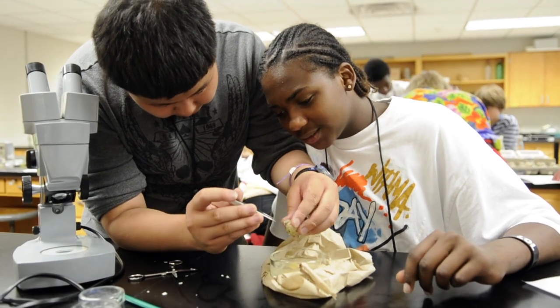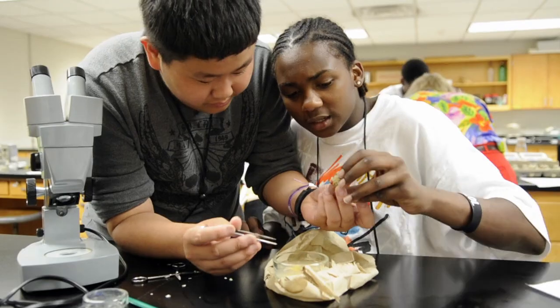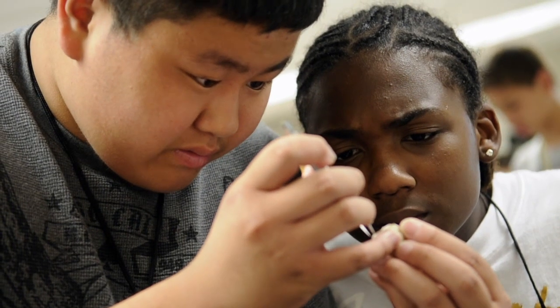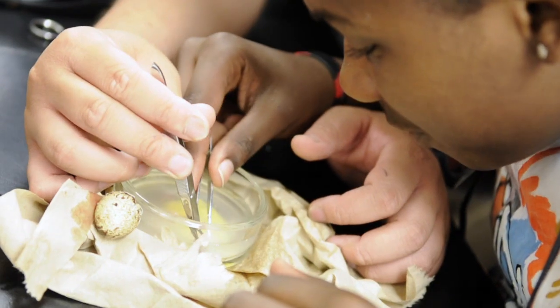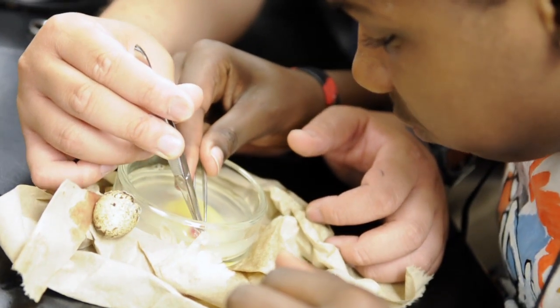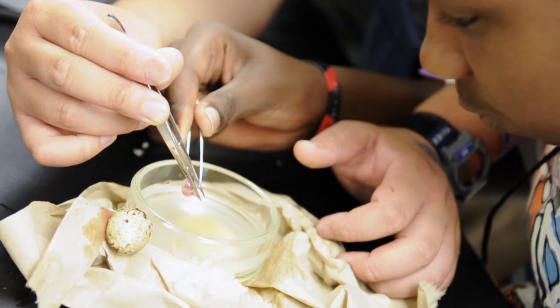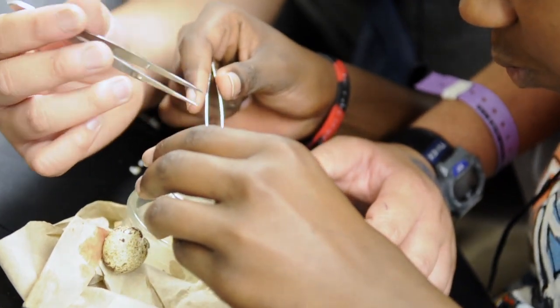One of the hard parts was that once you dump the embryo out and the yolk out, you're supposed to separate it. That was the part where it got kind of tough, because if you were to kill the embryo, the whole entire experiment would go wrong. When you had to separate it, you had to use two tweezers — if you were to squeeze too hard, they would die, but if you didn't squeeze tight enough, they would slip off.